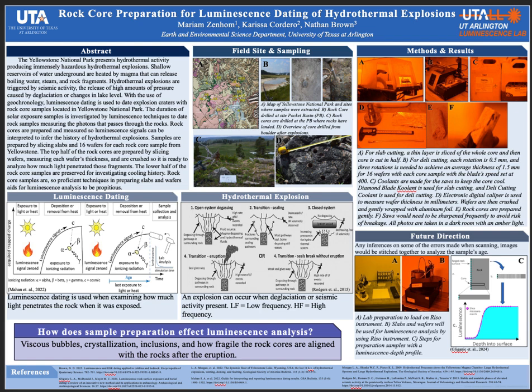As these are being prepared, our future goal is to have a luminescence depth profile from the slabs and wafers that were prepared, run on a RISO instrument shown in image B, which is used for luminescence analysis. This will give us a better understanding of how hydrothermal explosions occur and the age of the crater from the rocks. Thank you.